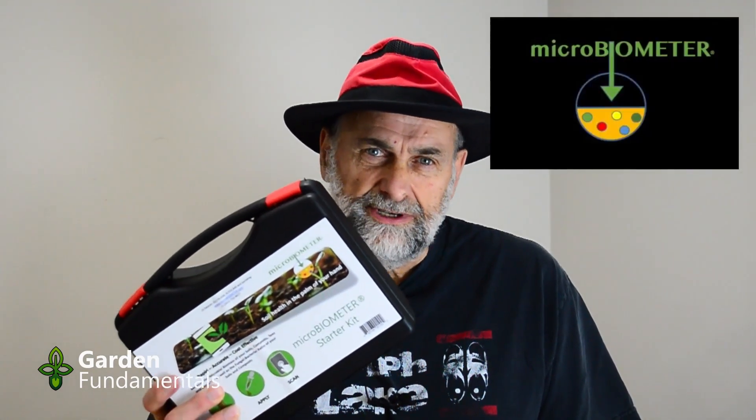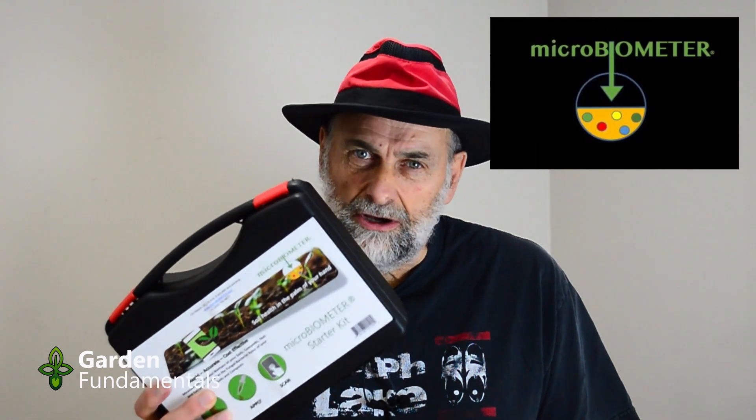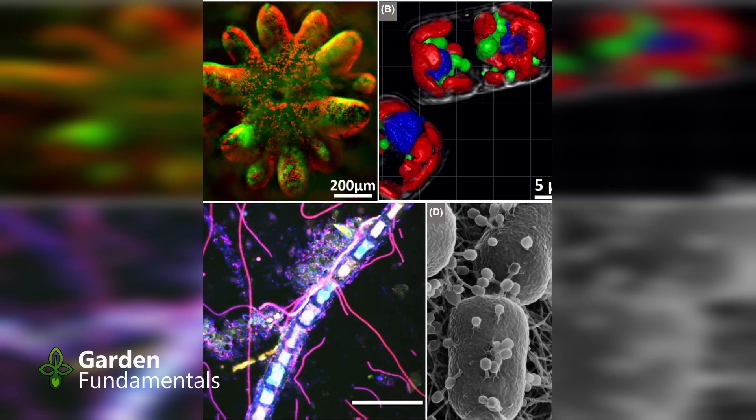The Microbiometer is a new tool for measuring microbes in soil, compost, and compost tea. Why would you want to measure microbes? Well, microbes are the secret to healthy soil and healthy plants. Gardeners talk about these microbes all the time, but up till now there's been no way to actually measure them. That's changed with this test kit.